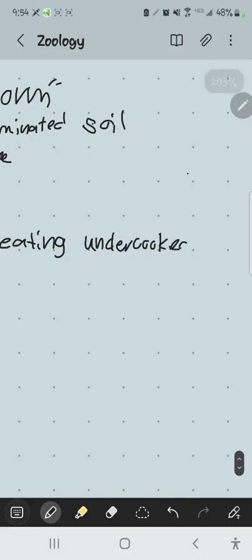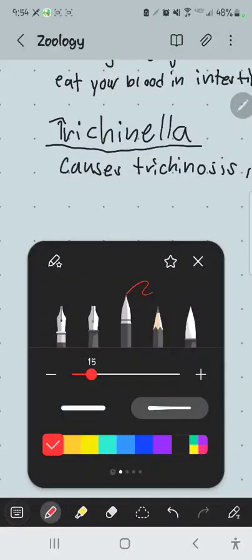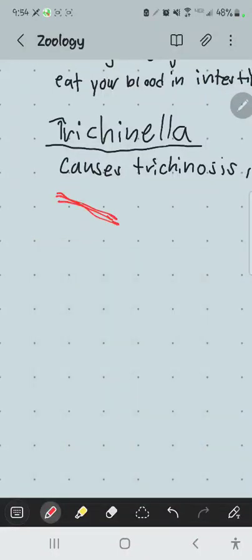So anyway, what's going on here with this one is this is muscle tissue, and I'll draw it here. These little spiral things are essentially a cyst in the muscle that has the worm in it. But what you're seeing with trichinosis is here's the muscle tissue going like this. Muscle tissue is very fibrous, and what you're seeing basically is fibrous muscle, and you'll see these little pockets. And then in the pocket, you're going to see basically a worm.